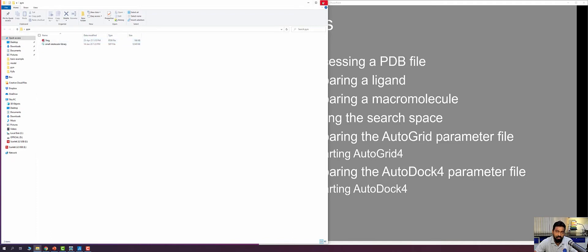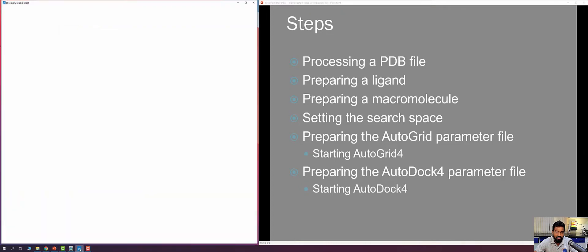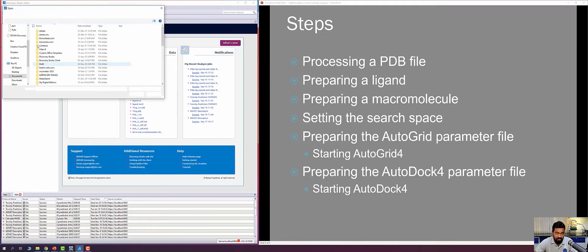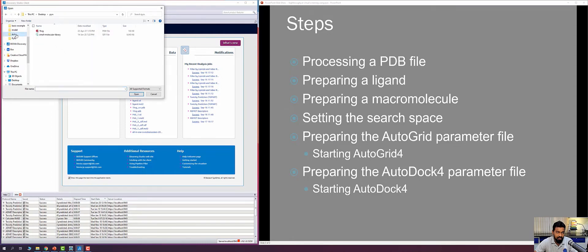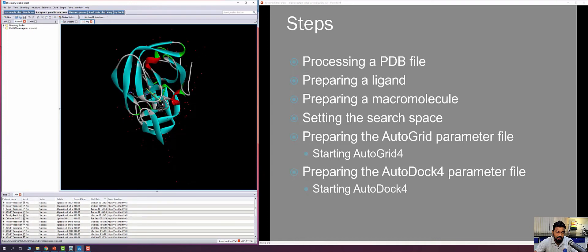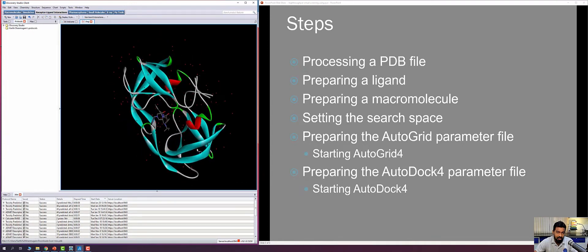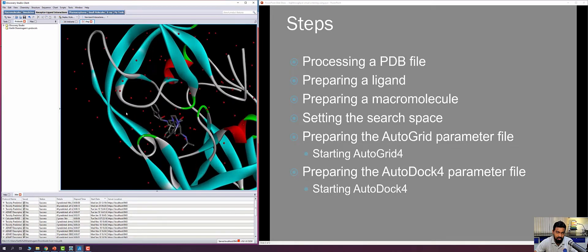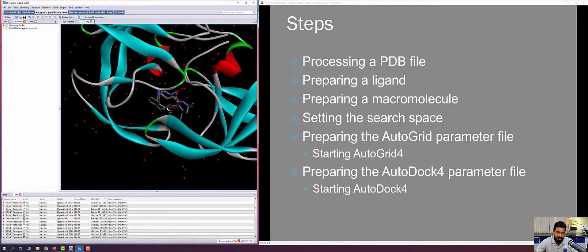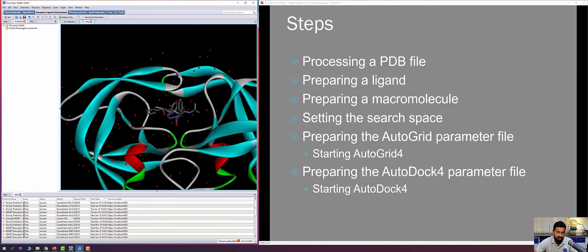We are going to screen this small molecule library to the binding pocket of 1HSG to find which small molecules have higher affinity, using PyRx. I highly recommend pre-processing the protein molecule with Discovery Studio Visualizer before using it in PyRx. I go to File > Open to load the 1HSG protein molecule from the desktop pyrex folder.